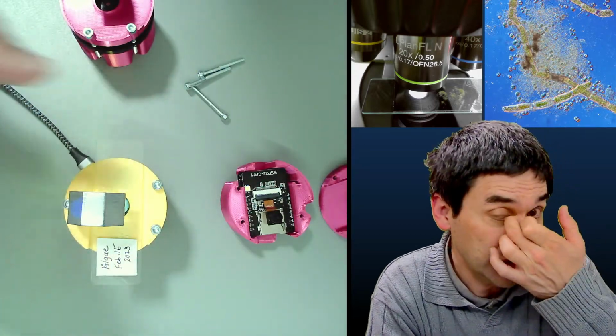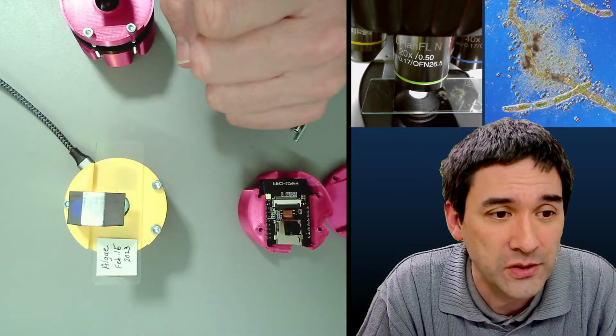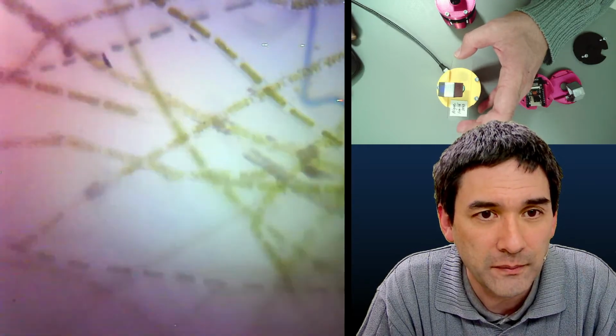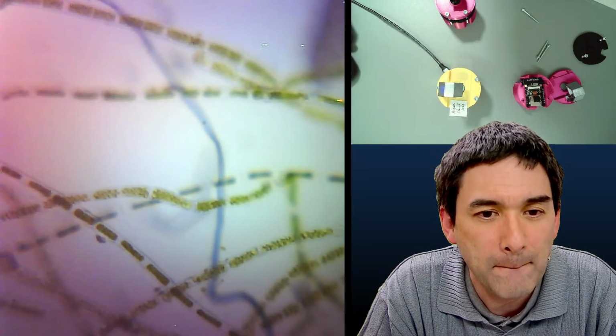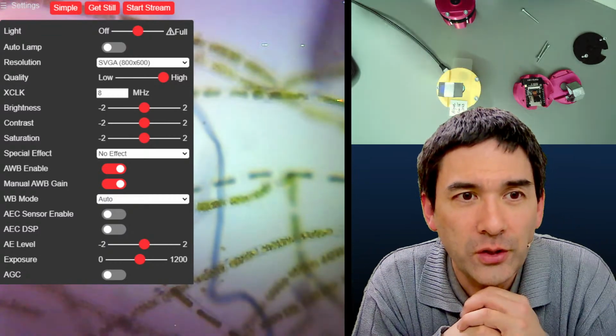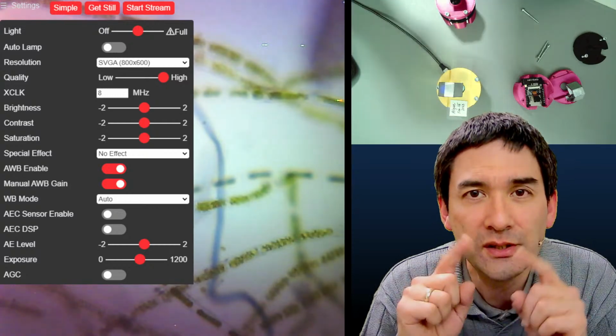So what I'm going to do now is show you some of the things that you're able to do with that microscope. Over here, that's again the view, and I'm going to show you now something. Look at this. Bing! You actually have a little software here, which is a camera control. And how do you access that? Well, what you do is the following.